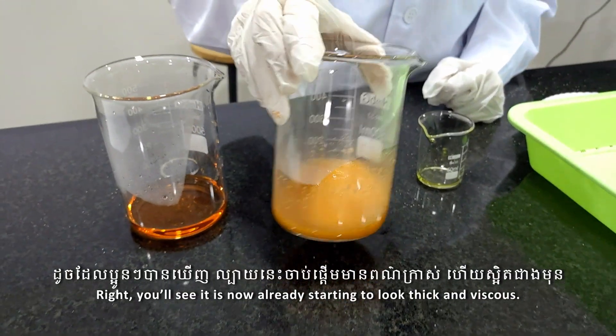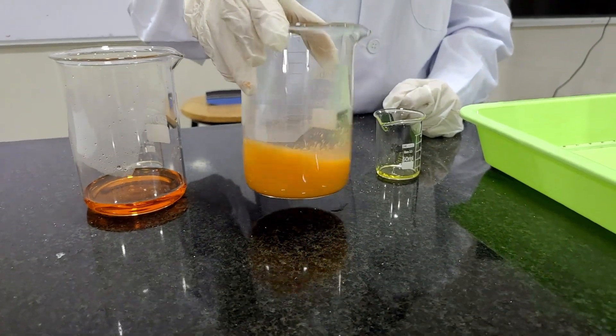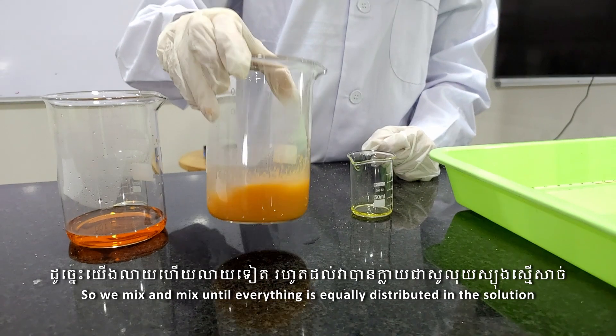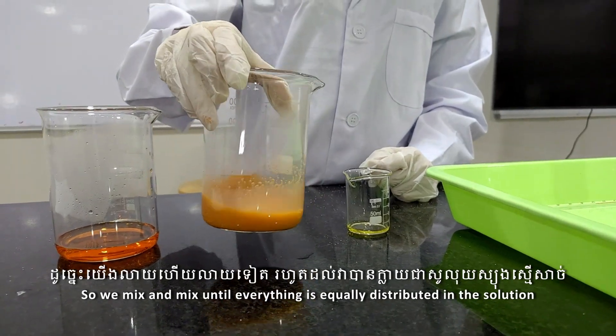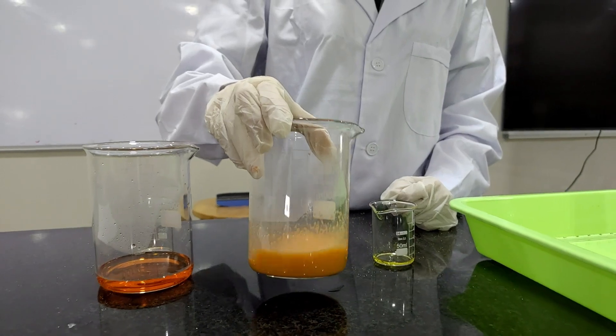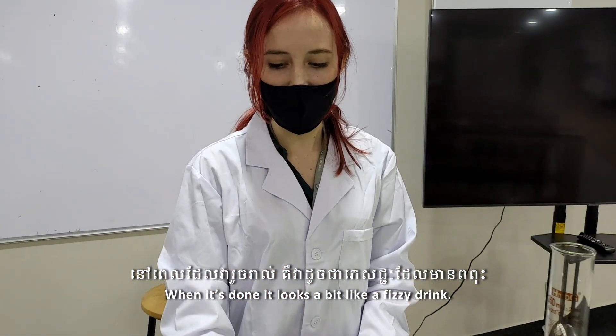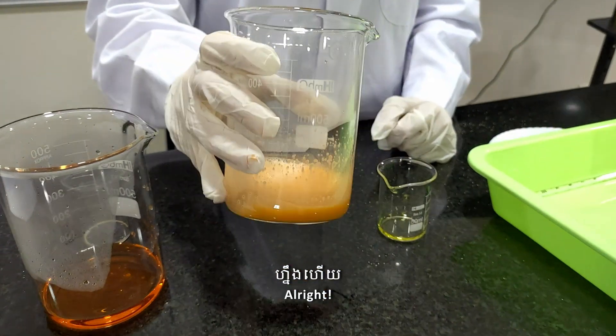You'll see it is now already starting to look thick and viscous. We mix and mix until everything is equally distributed in the solution. When it's done it looks a bit like a fizzy drink.